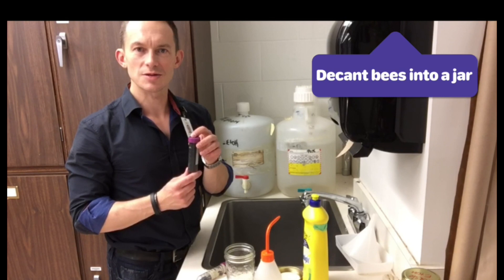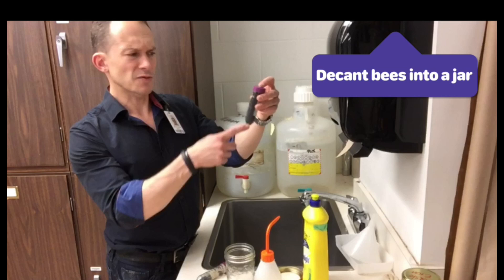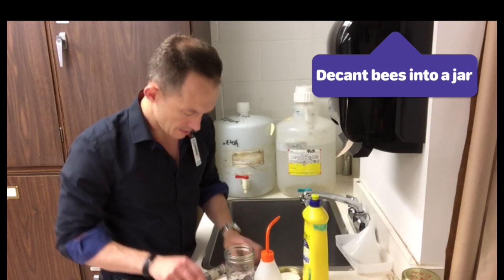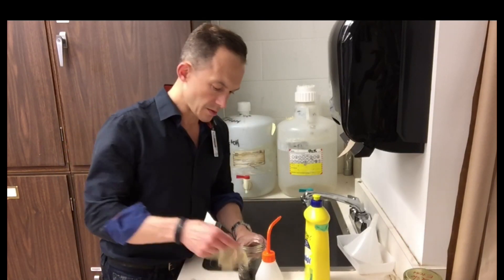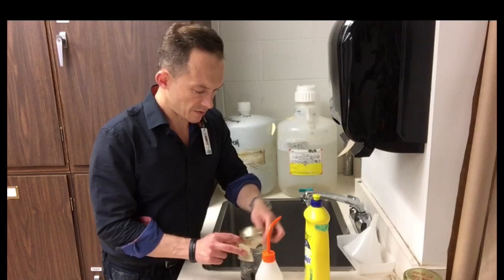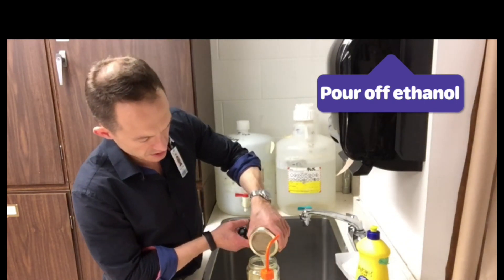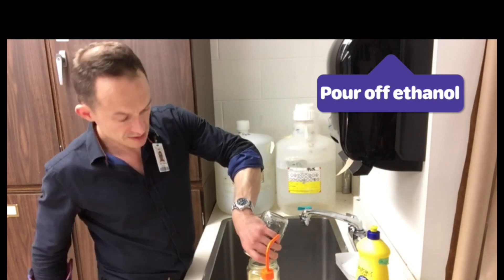Essentially the first thing you're going to do is give your bumble bees a shampoo. Here I've got a centrifuge vial with about 50 bumble bees currently collected in 95% ethanol. I just dump them all in here like that. Make sure you pull out any labels. Next I'm just going to cover this with the mesh and pour it off — pouring the ethanol into a waste ethanol jar. You don't want all that ethanol to go down the drain.